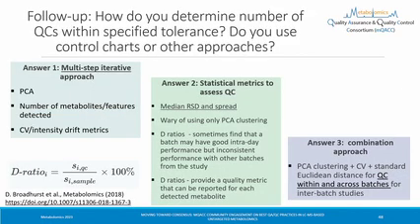After that, we started a discussion with the audience to gather more information about how different labs decide whether QC is within a specified tolerance or not. Do they use control charts or other criteria? And here we saw a breadth of different approaches.